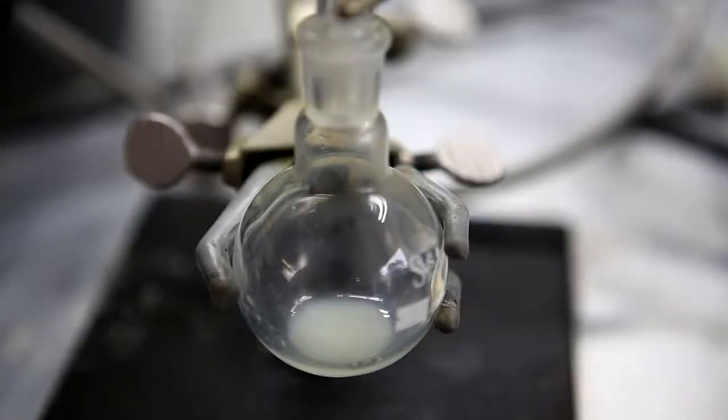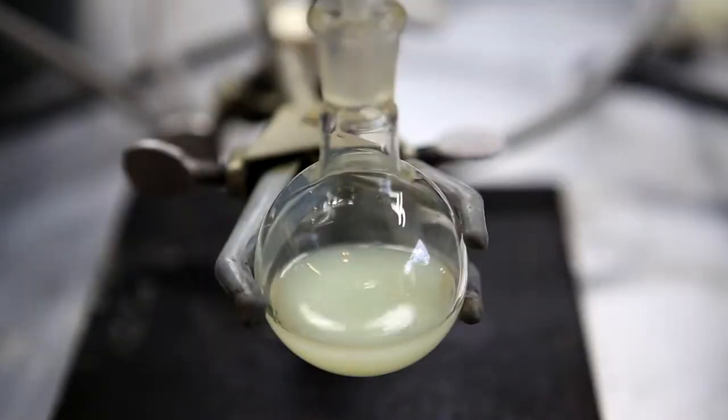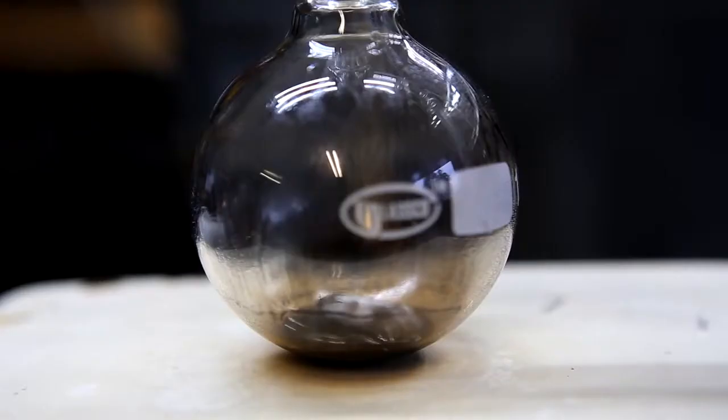Also, it's important to not distill until dryness. As the distillate came over, it should be a cloudy white color because there's still water present in it. In the distillation flask, we're left with a thick brown goo.